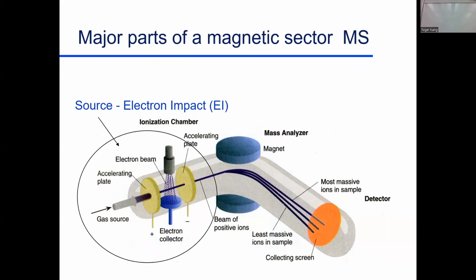And so all of your mass spectrometers, in some way, of course, are generating or blowing your particle of interest into pieces. This one just shows high energy electrons. Your sample comes in here, passes through high energy electrons, which blow it into bits, and then an accelerating plate draws out only a certain charge ion. It comes out here, and it's bent by a magnetic field.